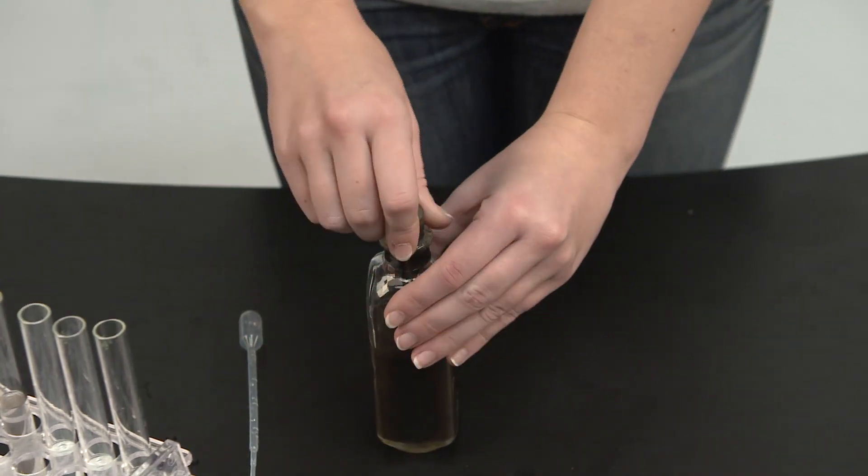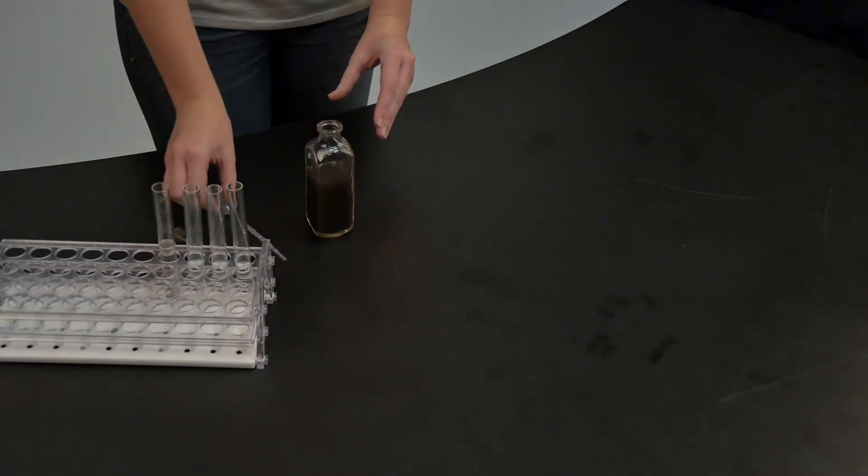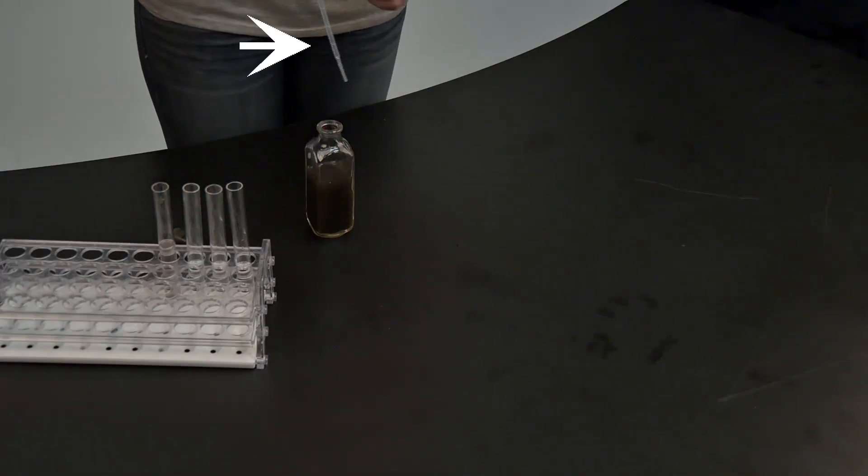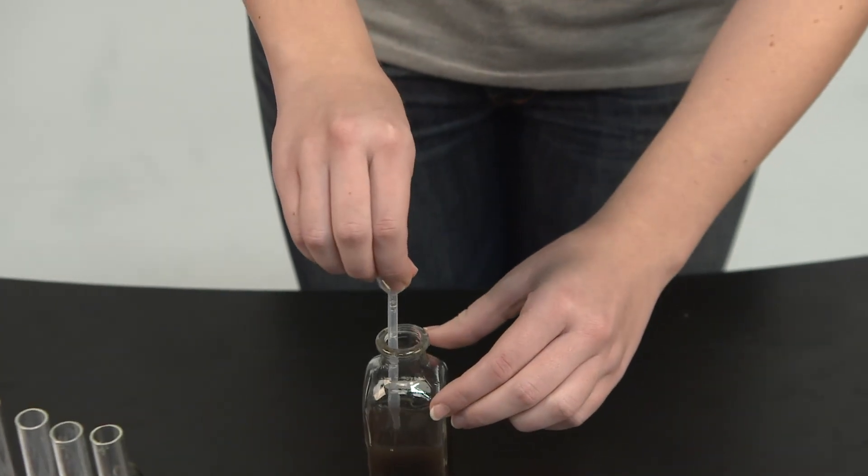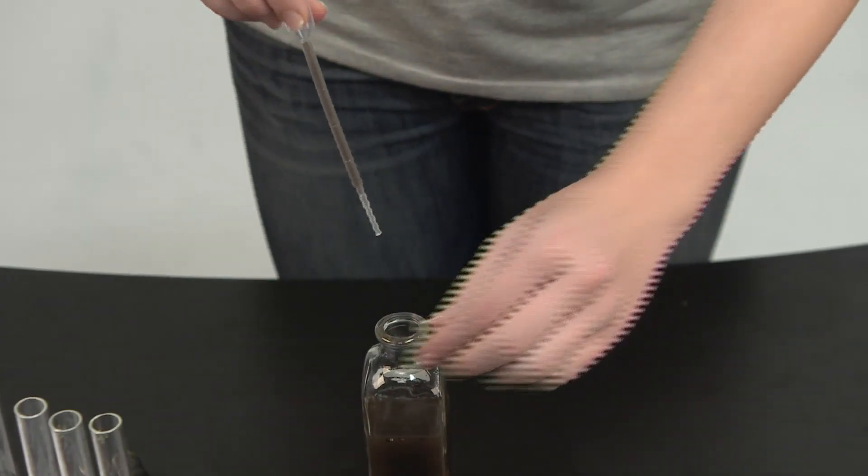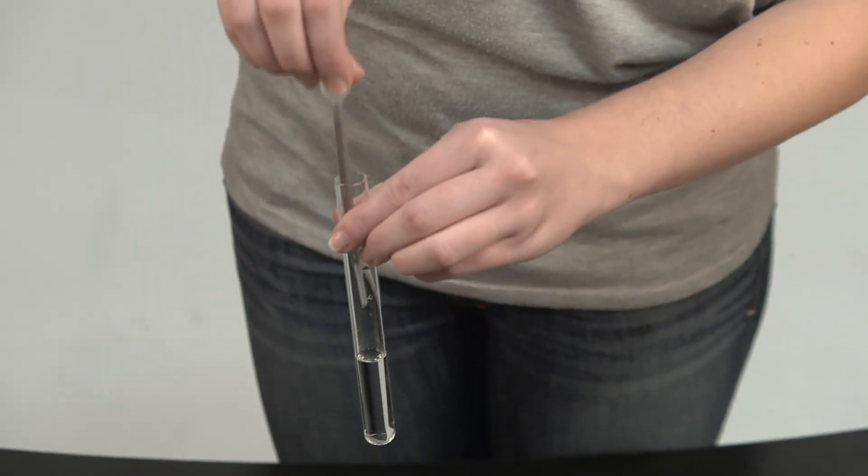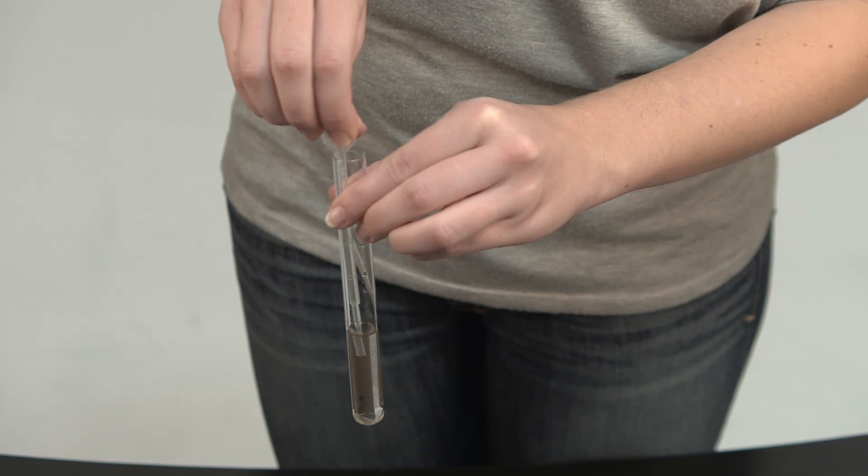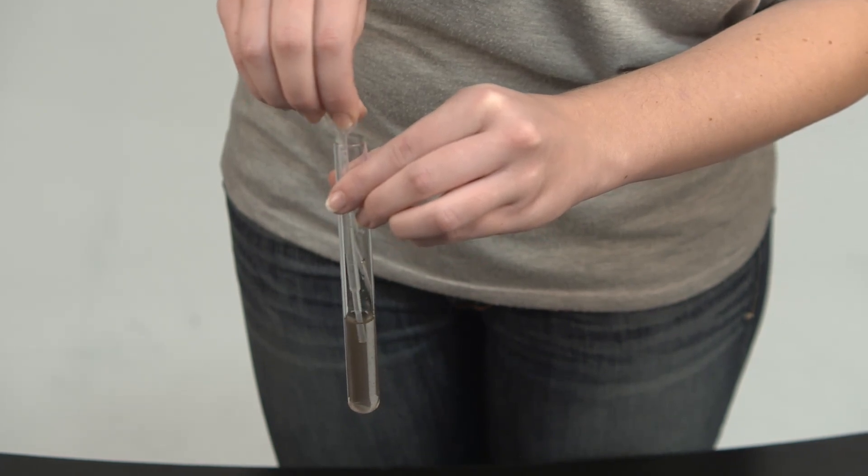After you have thoroughly mixed your soil sample in water, remove one milliliter using a plastic transfer pipette. Transfer this from one container into another container that has only pure water in it. Pipette up and down in order to mix thoroughly.